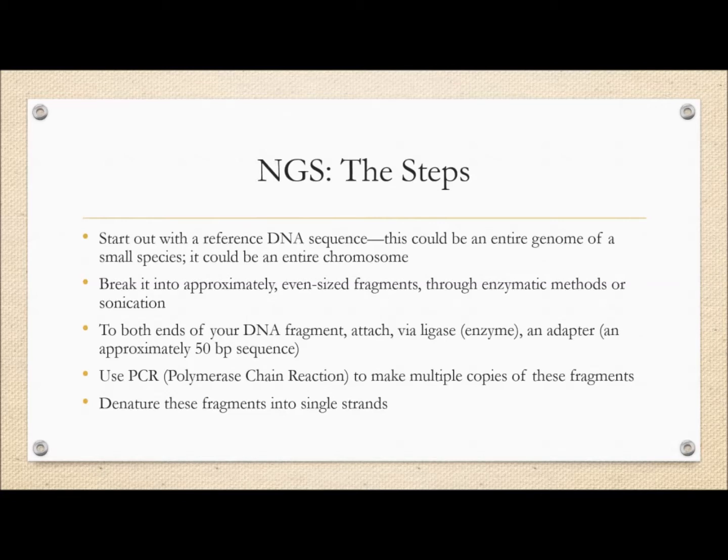That is where you do not have a reference genome and where you actually have to make sure not only that the reads are stitched together correctly, but the order in which these reads are put together is also very important. So de novo sequencing requires a lot more processing power and a lot more computational effort.